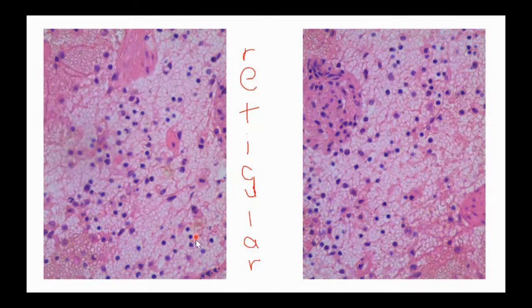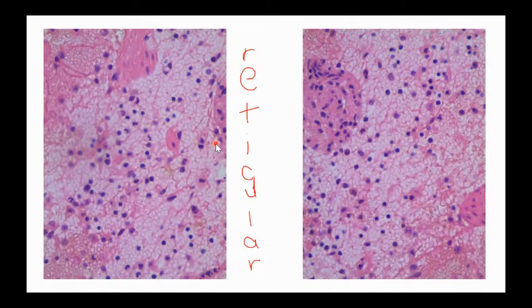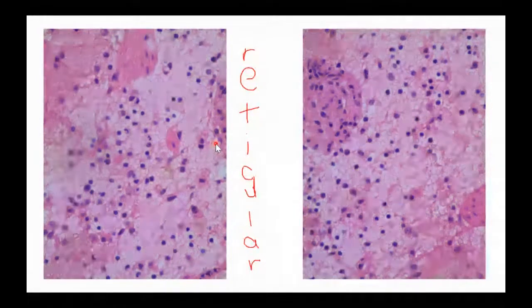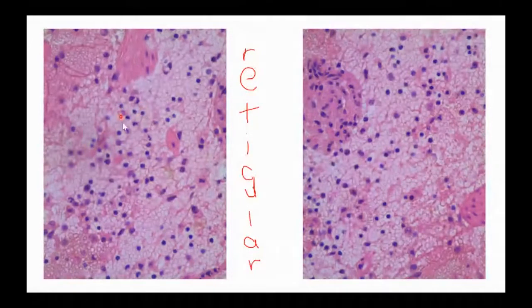What you're actually seeing too, these dark spots, by the way, on these images, are some of those leukocytes, some of those white blood cells. So this, remember, is the type of tissue that does a lot of filtering. We're pulling out bacteria, we're pulling out viruses. So when we look at this tissue, you're seeing those immune system cells that are sitting on top of these nets.